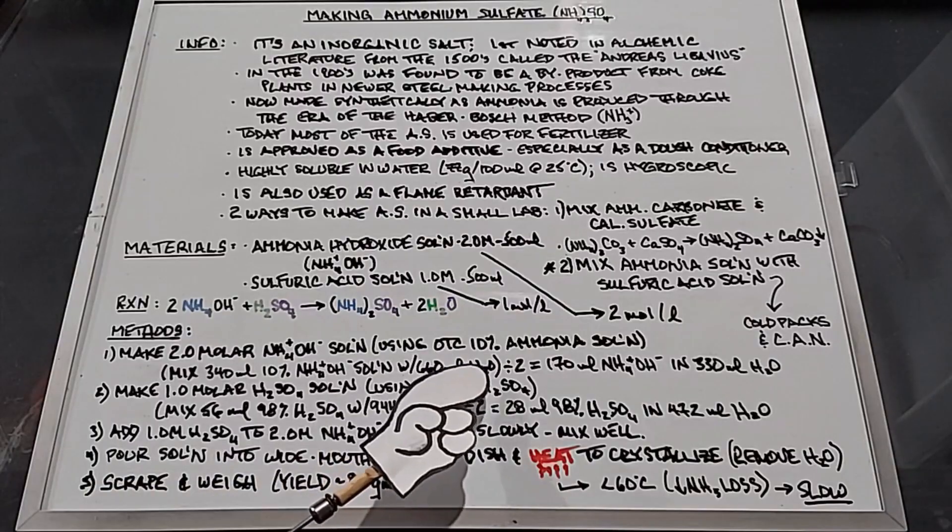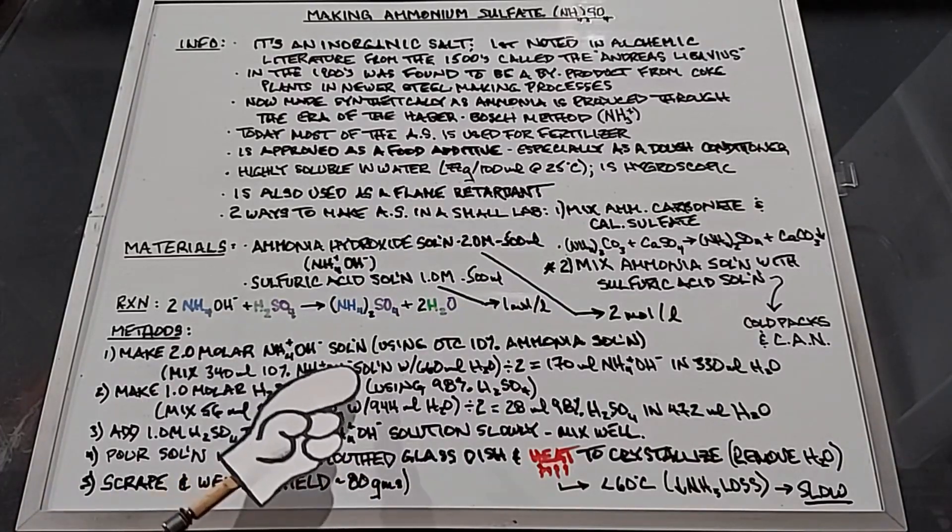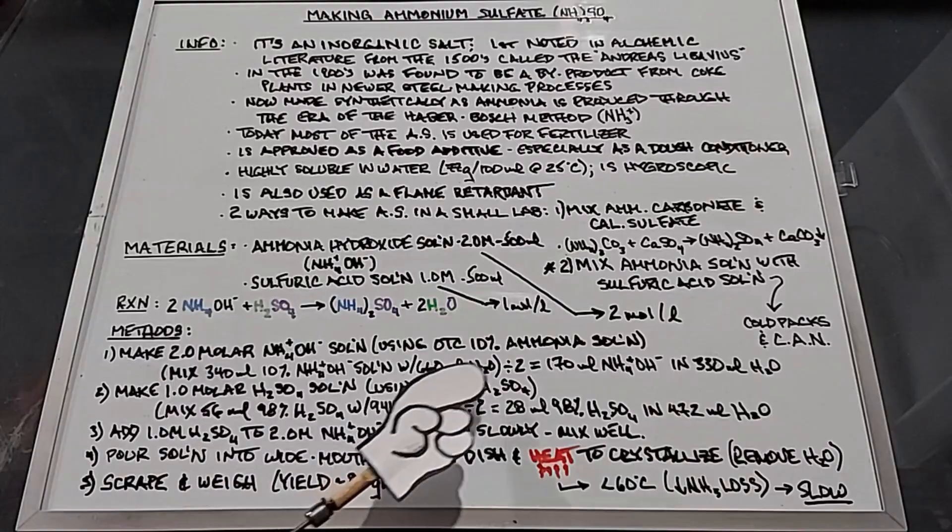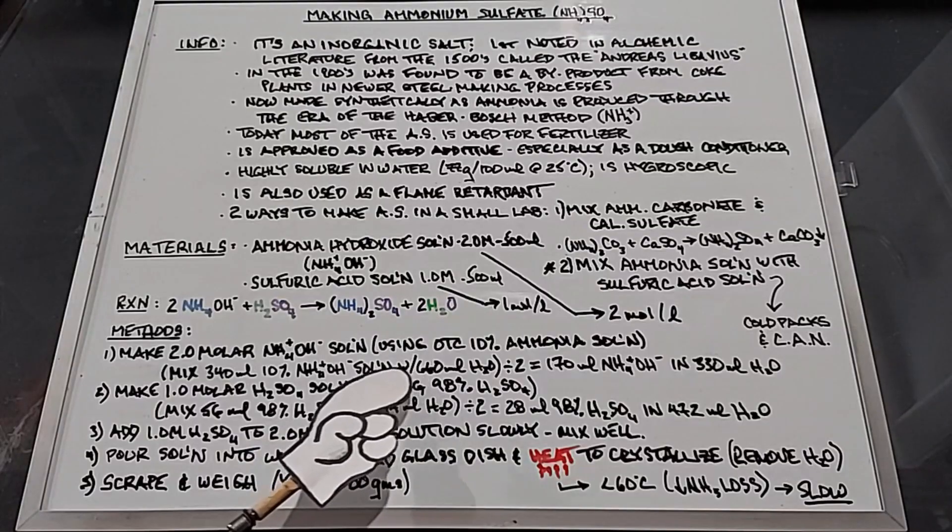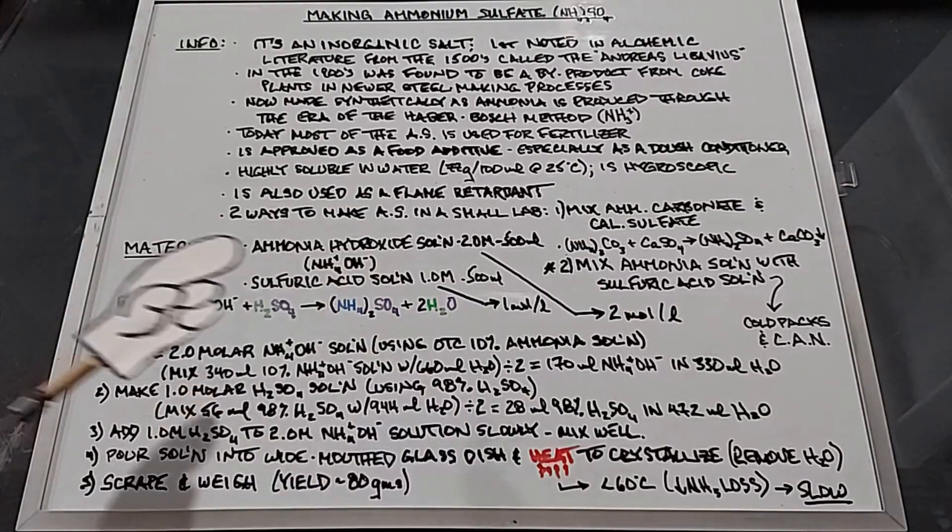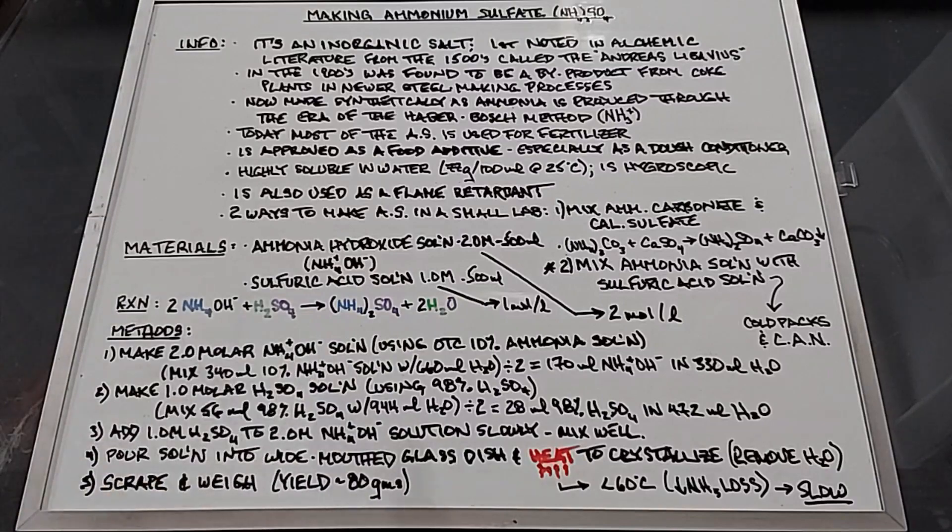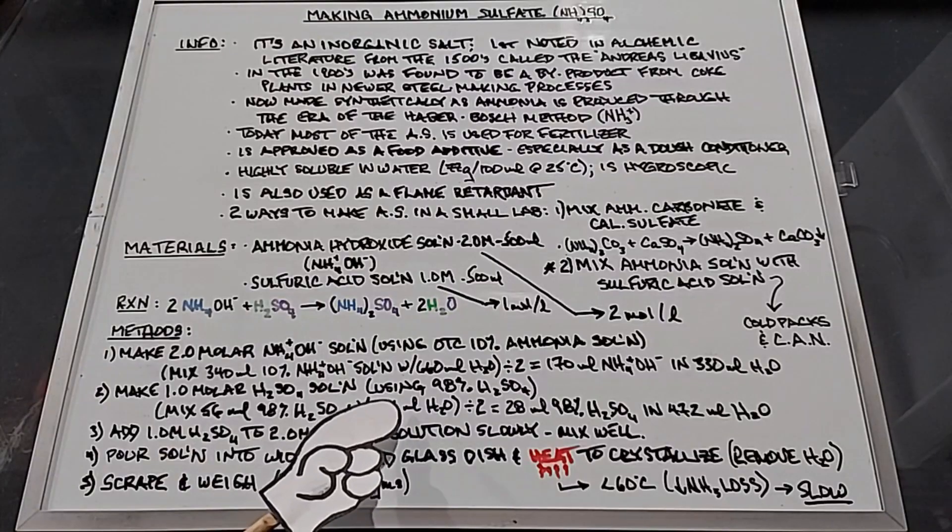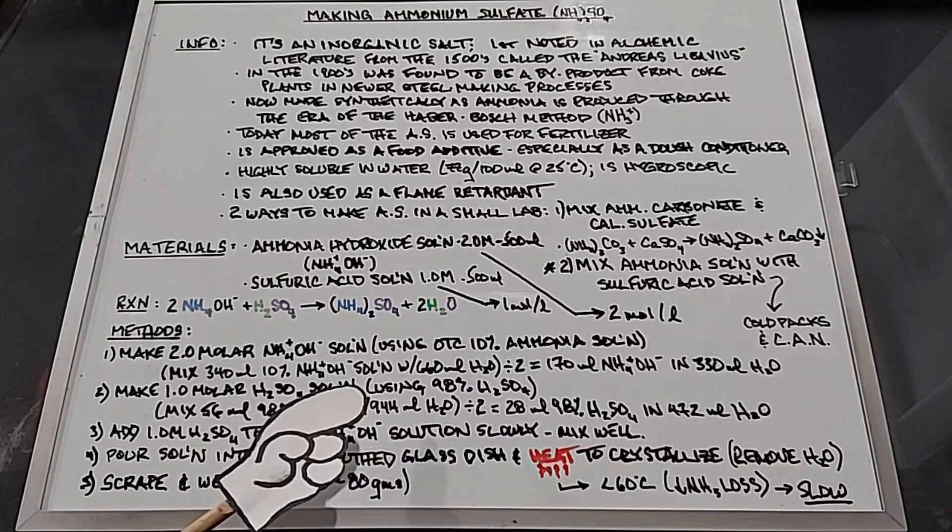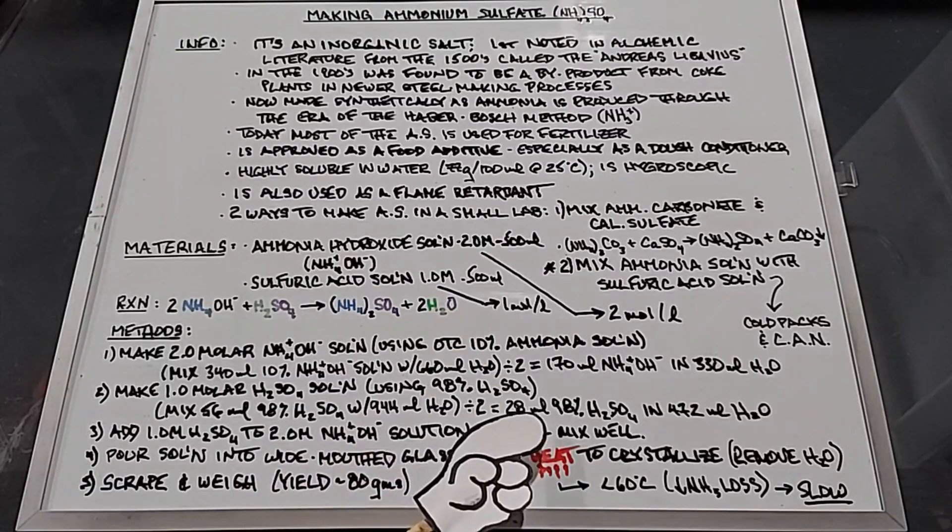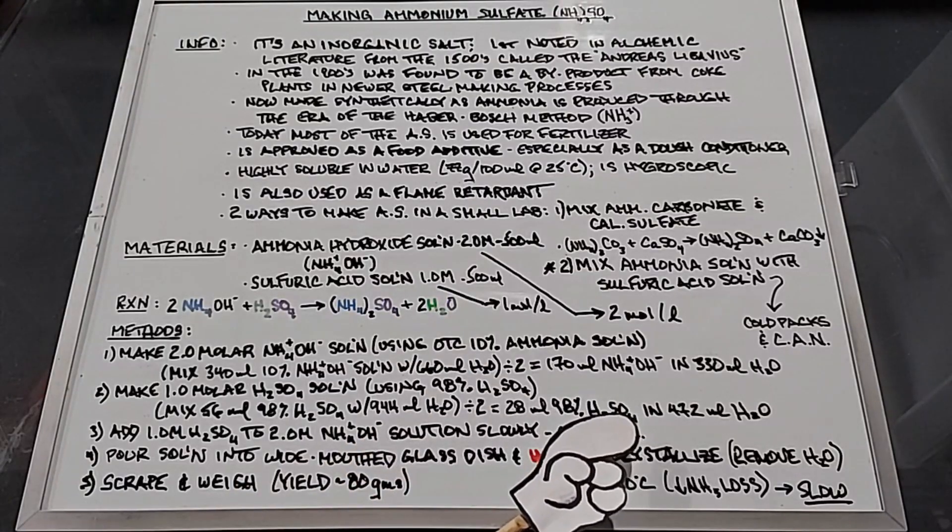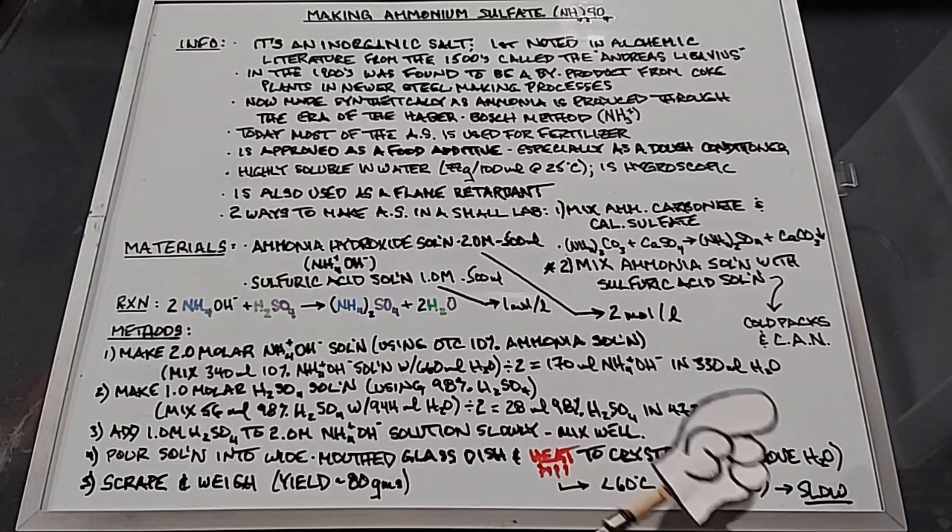Number two, we're going to make a one molar sulfuric acid solution. I have 98% sulfuric acid. To make our one molar solution I'm going to mix 56 milliliters of the 98% sulfuric acid with 944 milliliters of water. If we divide it in two we have 28 milliliters of 98% sulfuric acid solution mixed with 472 milliliters of water, and you always add the acid to the water when mixing these two.